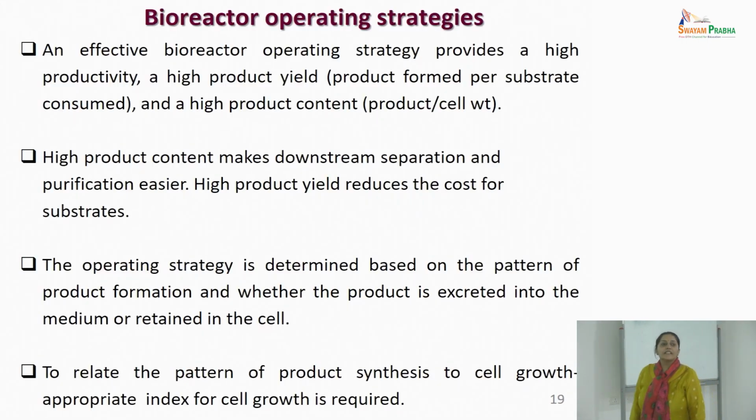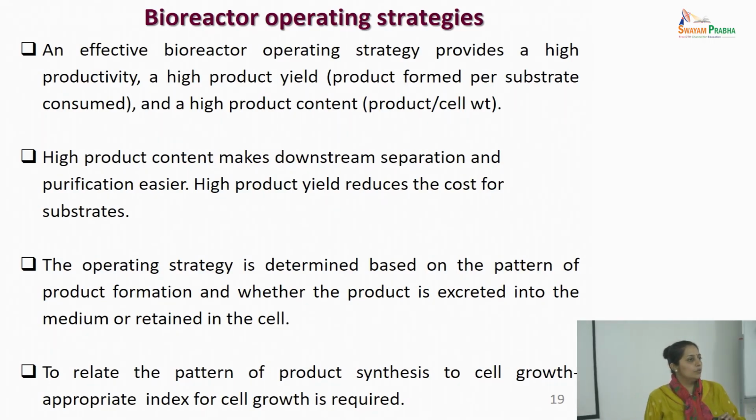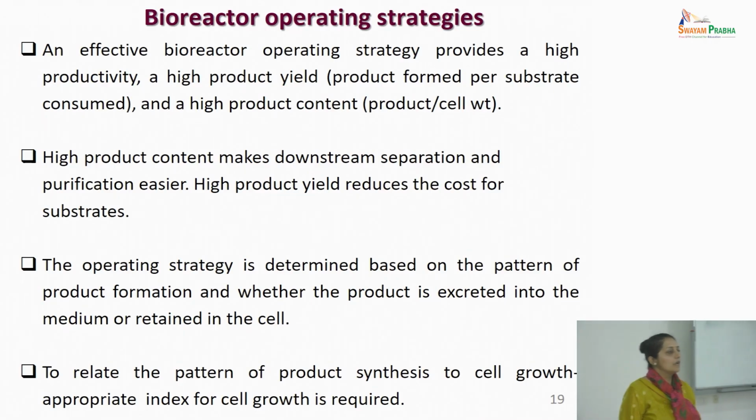Now, once you have finalized the geometrical design, you will do the plant cell cultivations, assuming that you have already optimized all the parameters at the shake flask level. So now you are assuming that you should be able to reproduce in this geometrical design and reach a productivity. Let's assume you have been able to reproduce the productivities or rather improve them, but all this is in batch. So you generally do batch fermentations.